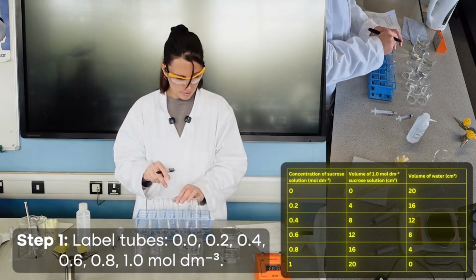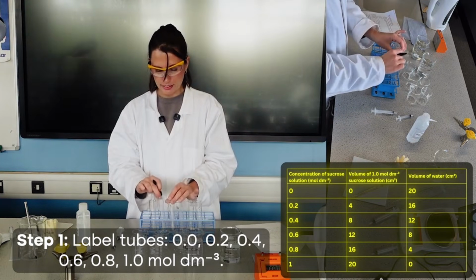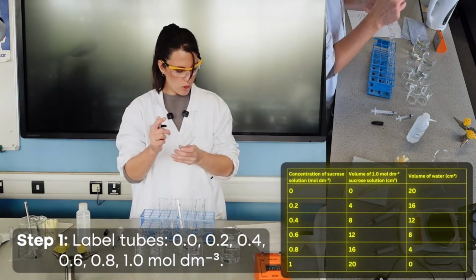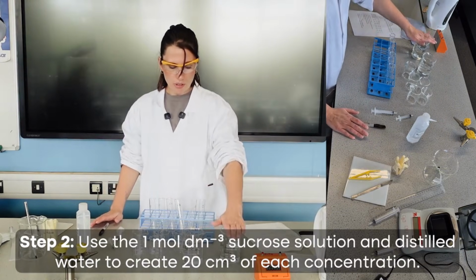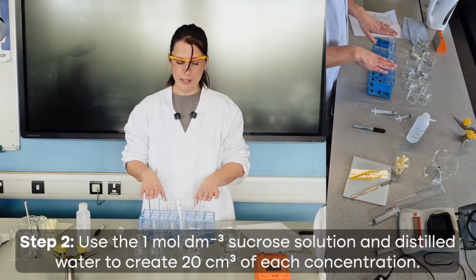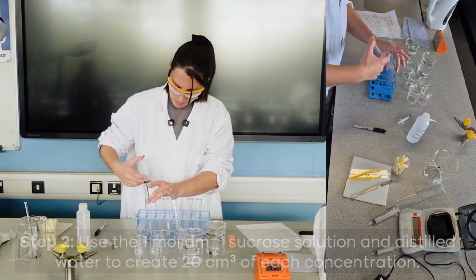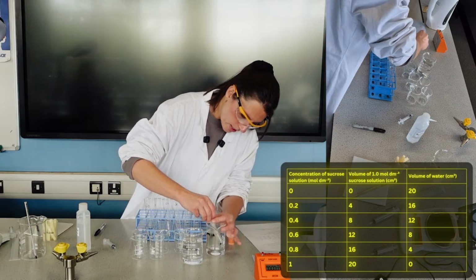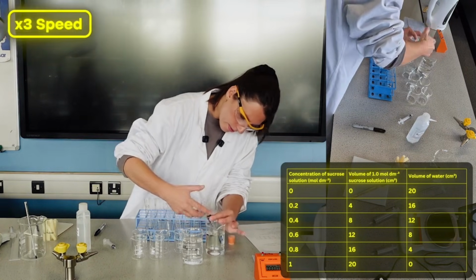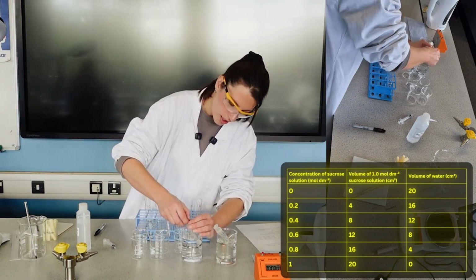0.2, 0.4, 0.6, 0.8, and 1. So the 1 mole, that's exactly what I've got here. The 0 is the distilled water. So I'm just going to put those in straight away, making sure that the bottom of the plunger is exactly on the line of the 10. I want 20 milliliters or centimeters cubed, so I'm going to do that twice. And then this one is just distilled water.